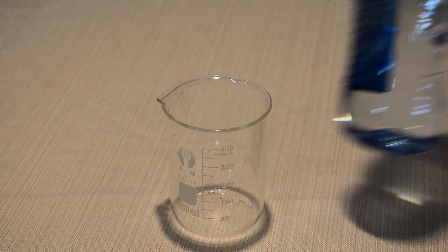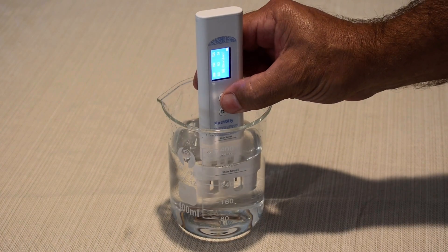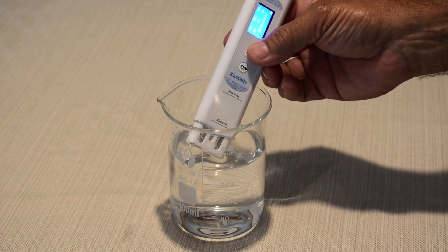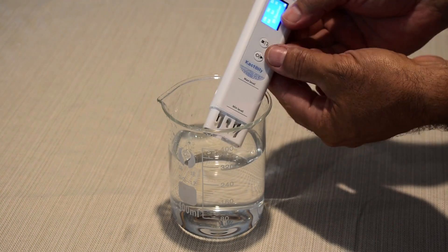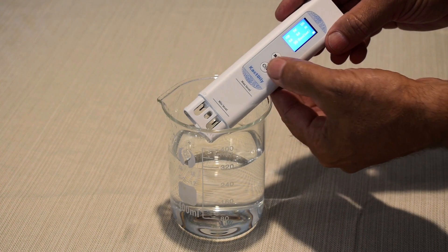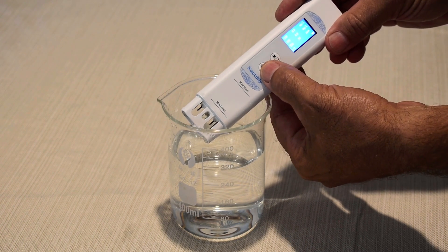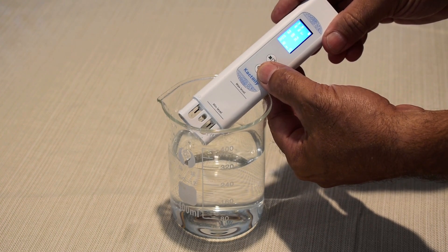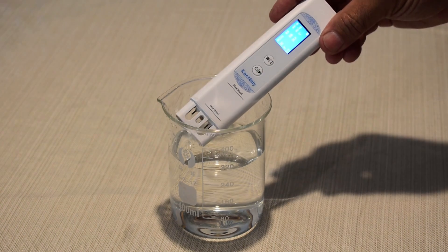Now ETERNAL. 99, excellent. COD, TOC is zero, TDS is 94, UV-275 is 0.003, electrical conductivity is 188.